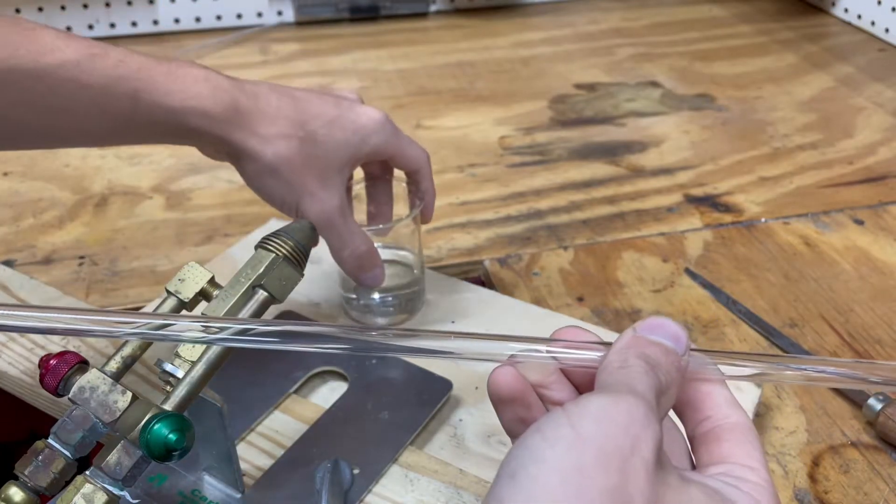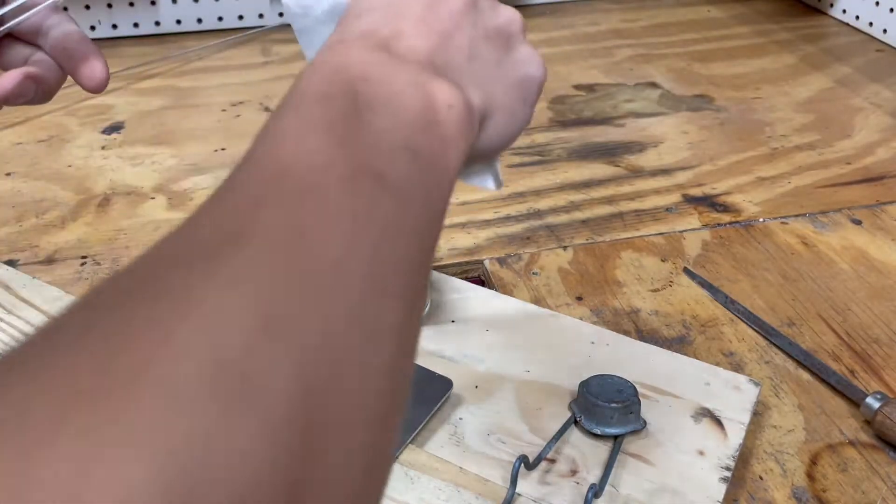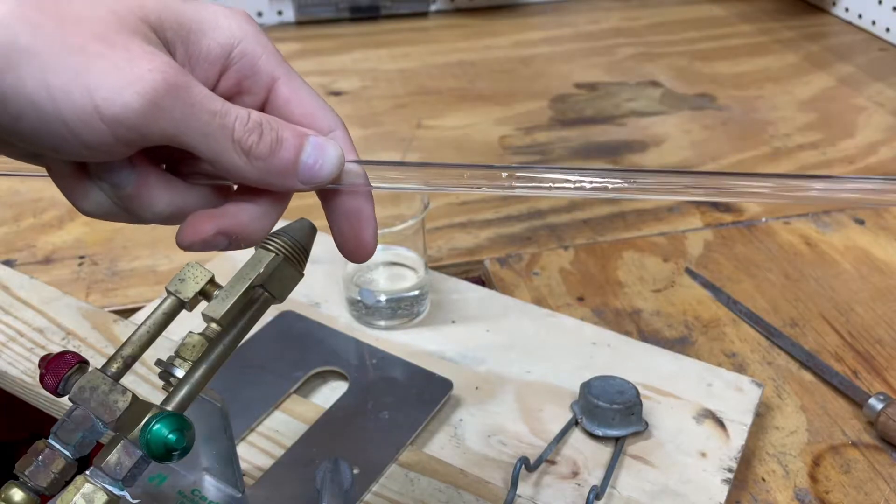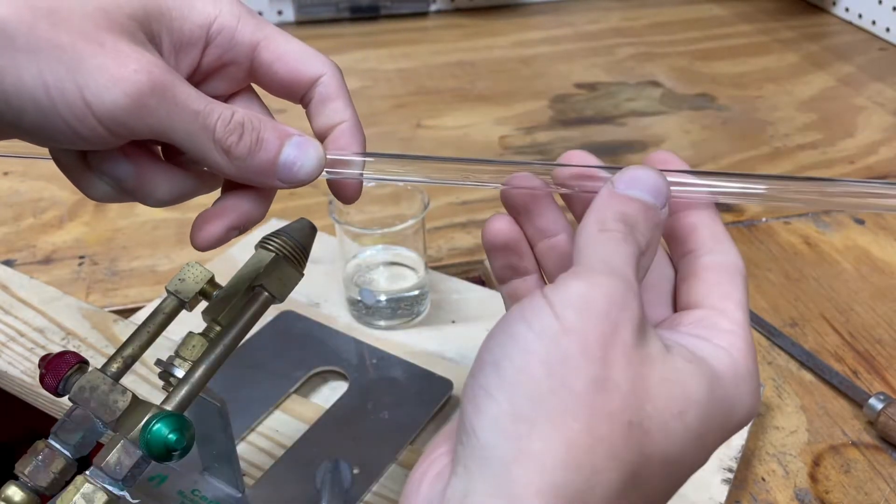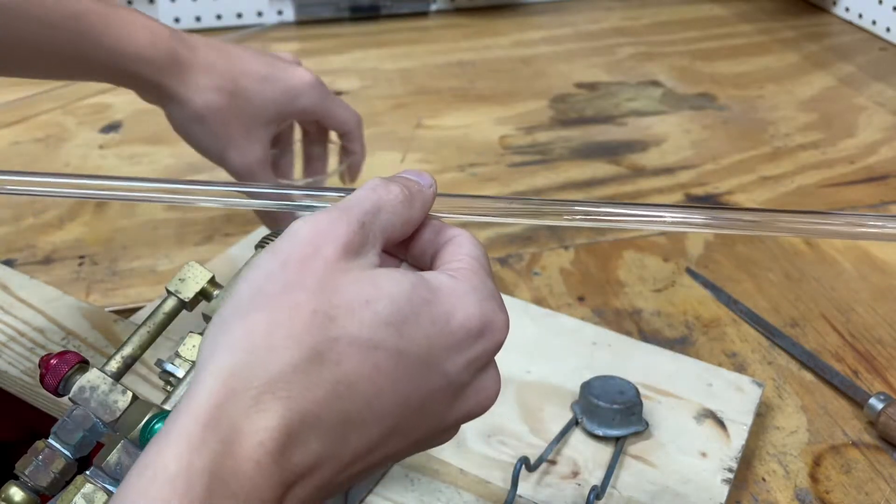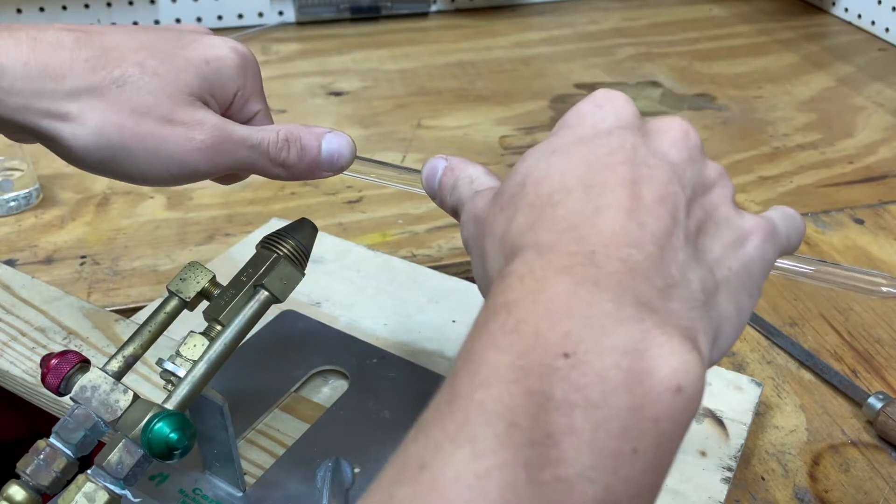Then you're going to want to wet this line by using a paper towel, spit or saliva, and wet the point. For the next part you're going to rotate the glass to where the score is on the other side of you, and then place your thumbs here and pull back and it'll snap.